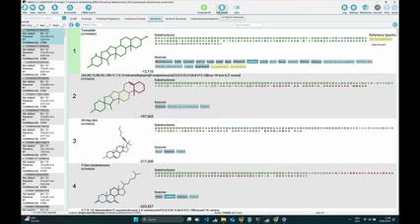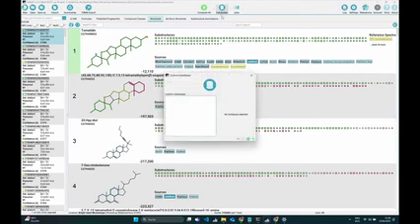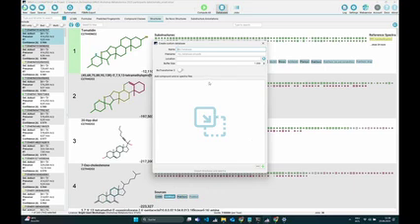And for this we are just going to click on this databases tab, and now we can create new databases or import existing ones. Just to show this very quickly, how you would create a new one. But in a second, we are going to just import some existing ones. If you want to create a new database, just click in the bottom right on this plus symbol, and you will get this screen. You can give your database a name, a location, so wherever you want it to be stored.